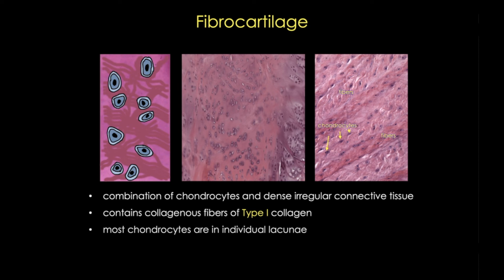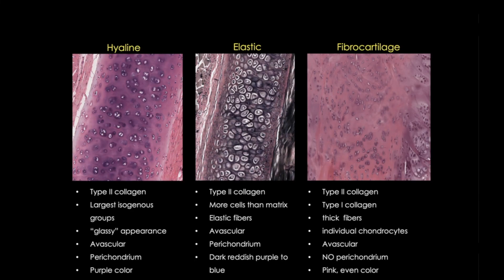Be sure to look for those chondrocytes — if you see them, you'll know that you're looking at fibrocartilage and not dense irregular connective tissue. And finally, the lack of a perichondrium, that outer dense layer of connective tissue that's essential for cartilage growth, also identifies this tissue as fibrocartilage.